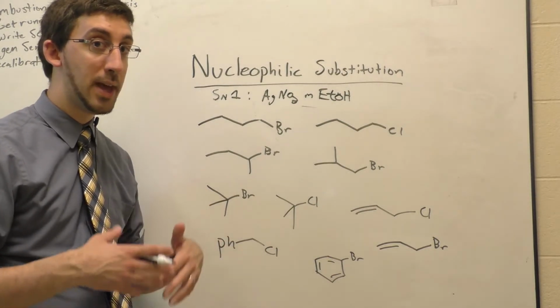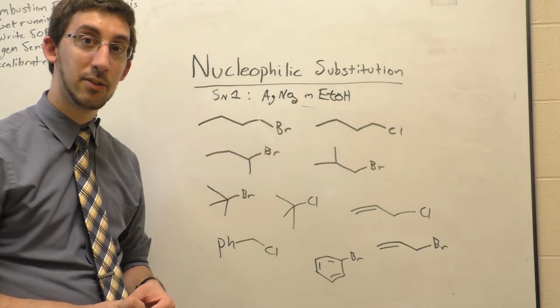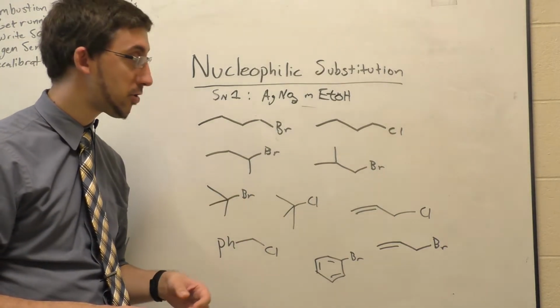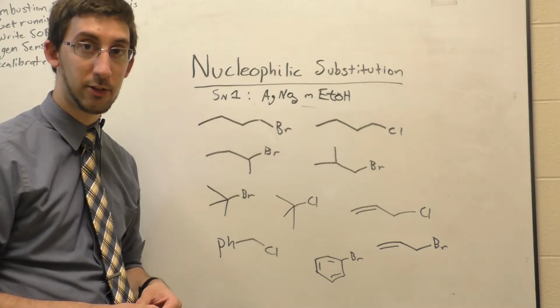So with that brief introduction, let's head up to lab and get things started and see what our results tell us about the effect of substrate structure and leaving group identity on the rates of nucleophilic substitution reactions.